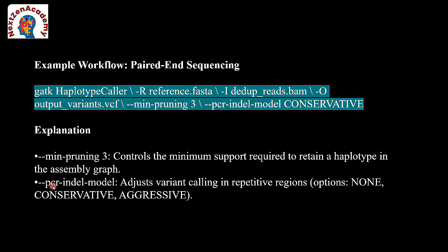Output is g.vcf, a genomic VCF file containing genotype likelihoods from HaplotypeCaller, with additional parameters and scenarios. First one is specific to a region of interest. We want to see specific regions, so we need to give the specific region intervals, chromosome position in detail.